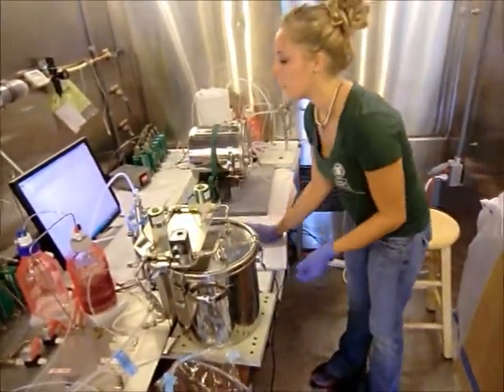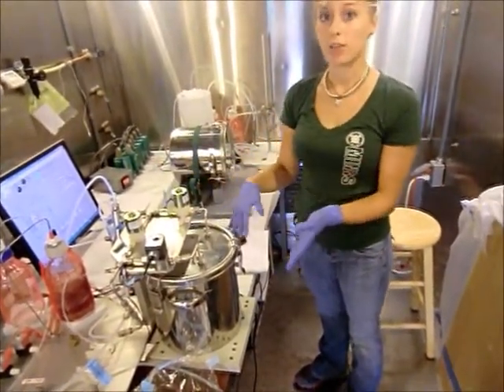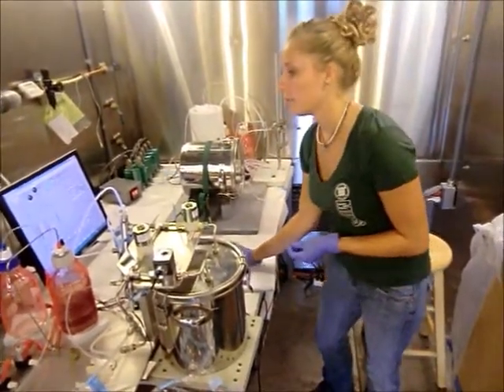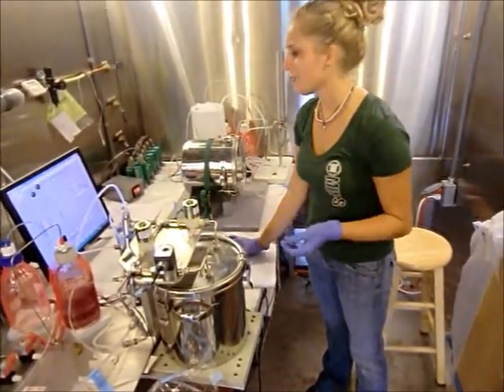Then I would come over to the program to load the proper sequence so that I know when it's bypassing and when it's going through the reactor. Today we'll run a 24-hour sequence to make sure that it's all working right.